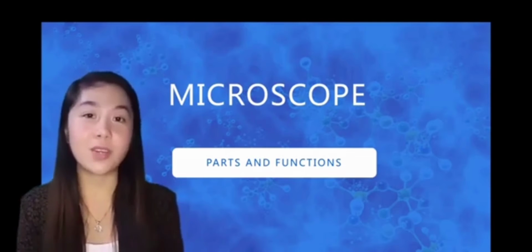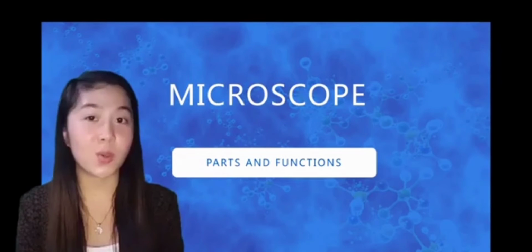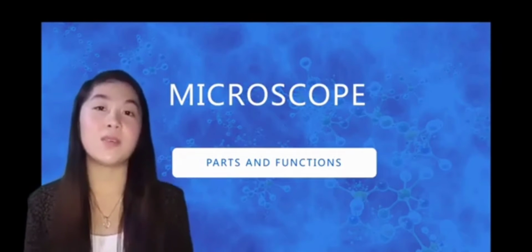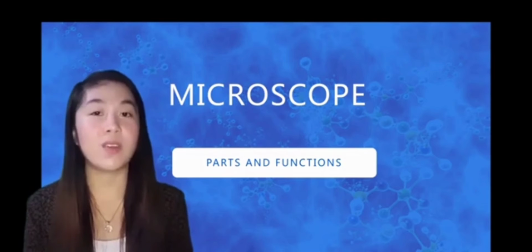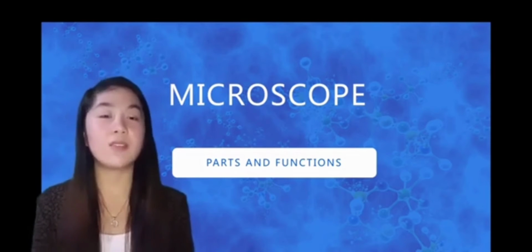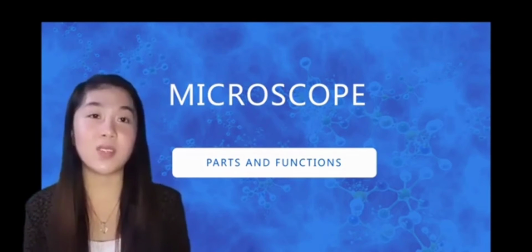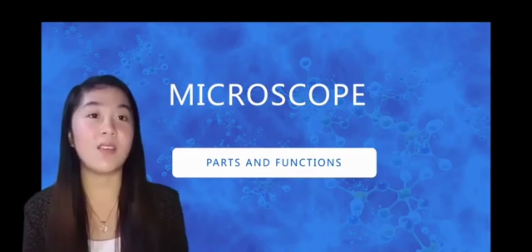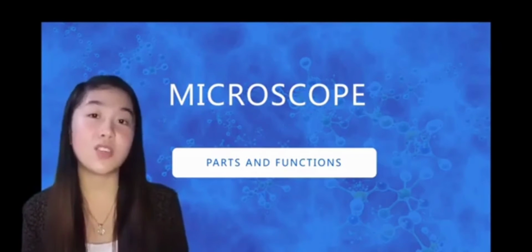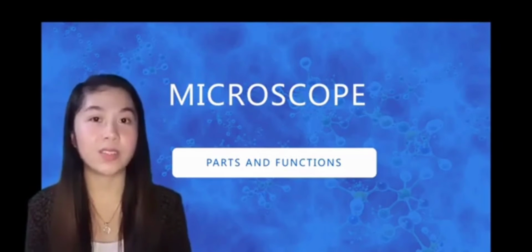I am Leslie Pearl S. Bungkasan, and this is my video presentation about the microscope with its parts and functions. Before I proceed, I'll just read to you my objectives. This video presentation aims to let us know the different parts of the microscope and also to have the knowledge on how each part of the microscope works.